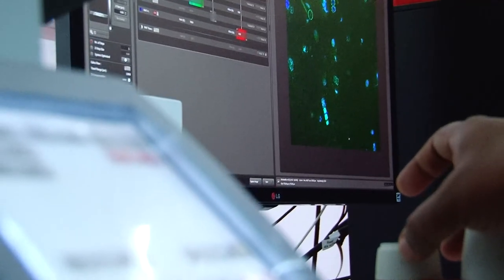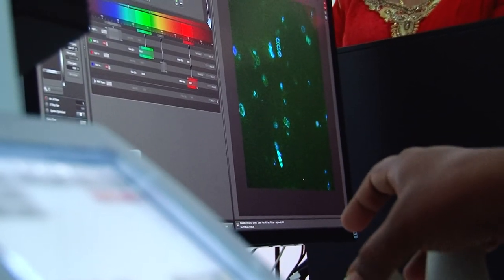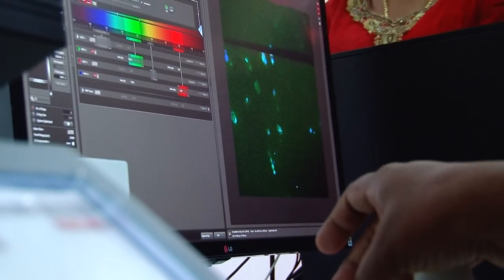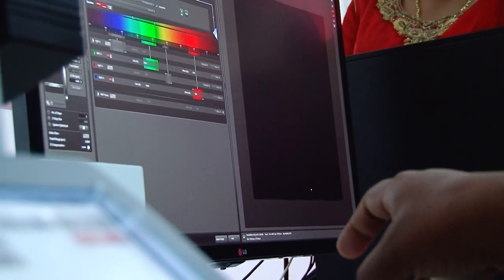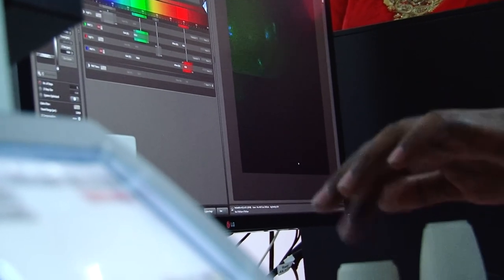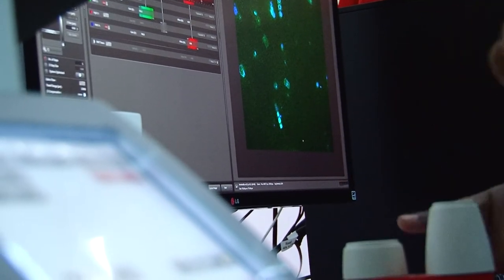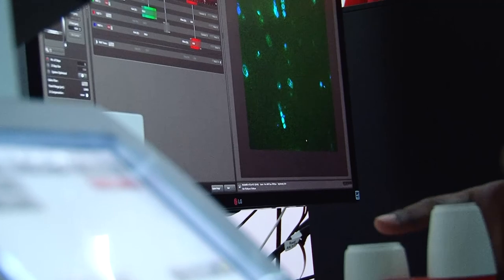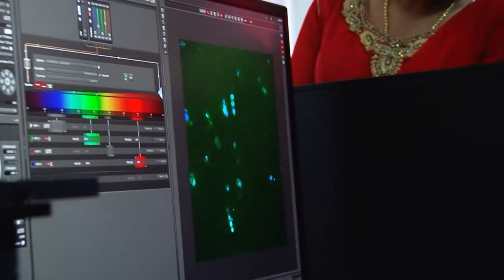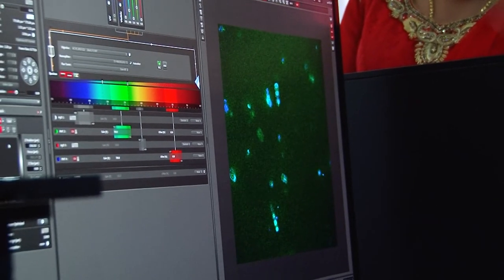Is that the way yours works? Like you turn it this way, it goes. Okay. Keep going, keep going, keep going. And then call that, whoop, too far, too far. I mean, you could do the Z stack on that, but it would be a little bit too deep. Okay, let's call that top right there. That's fine. Okay, call that your one Z point. Okay, and then go the other way. Go clockwise.